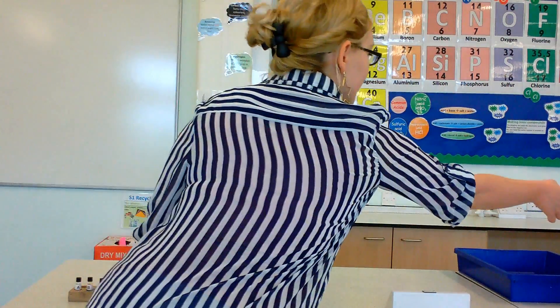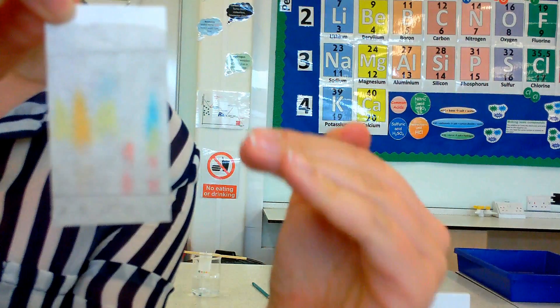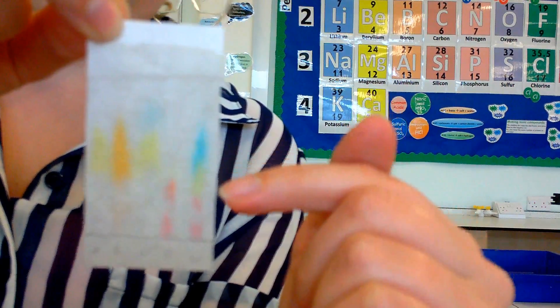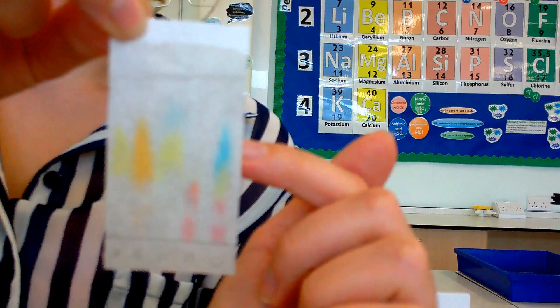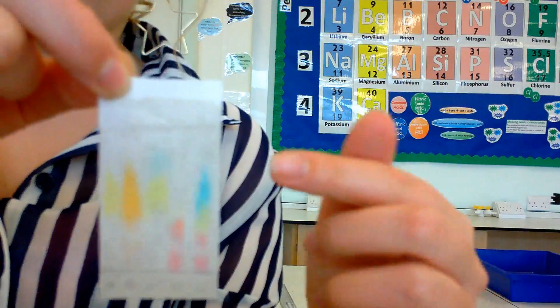Here's one I did earlier. You can see the level of the water here and the inks have been drawn up the paper. They're slightly different colours - all the different stains. So A clearly has some yellow in it, B has lots of orange, C has some yellow and there's a touch of blue at the top, and D has these two distinctive pink splodges. This was my U, my unknown. Qualitatively, looking at it, I can see that U has those two pink splodges so it's probably got D in it. It's got that yellow splodge so it's either got A or C in it, and it has got the blue at the top. You can just look at it colour-wise and say it's got the same colours and the spots look about the same distance.